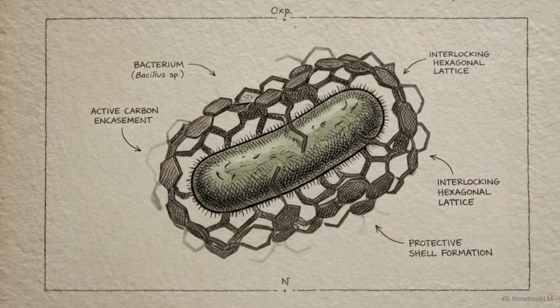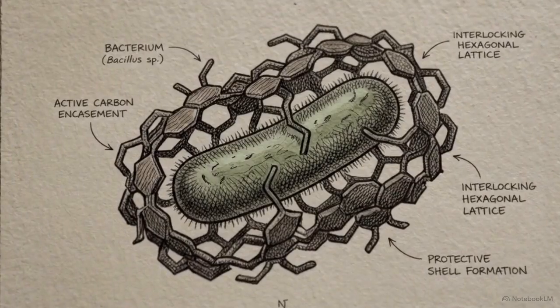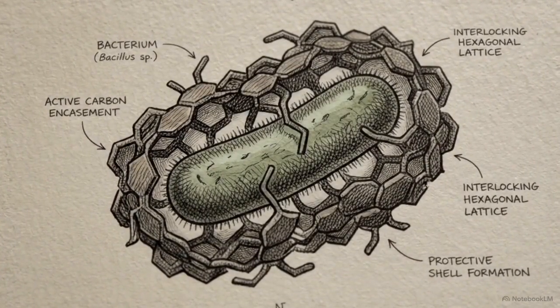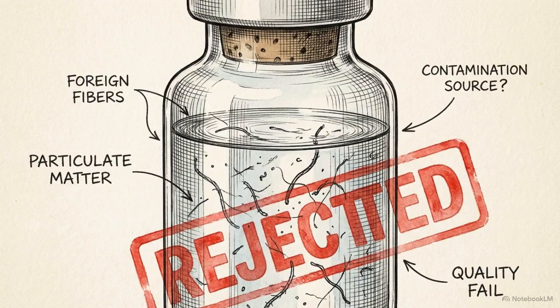In pharmaceutical water systems, total organic carbon, or TOC, acts as a microscopic shield. Organic carbon molecules enclose and protect bacteria from standard sanitization methods. Once protected, those bacteria multiply rapidly and release endotoxins, causing severe drug degradation before the product ever leaves the vial.